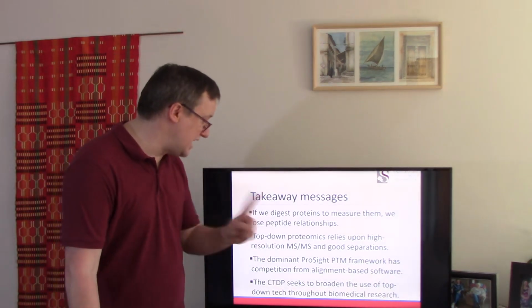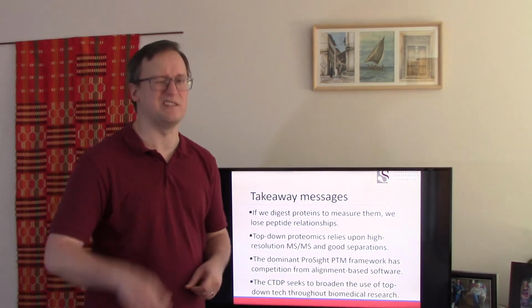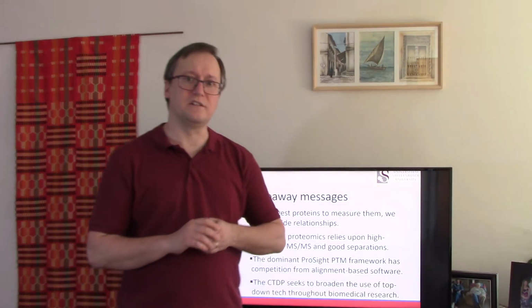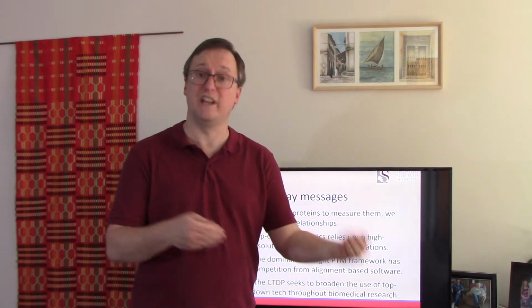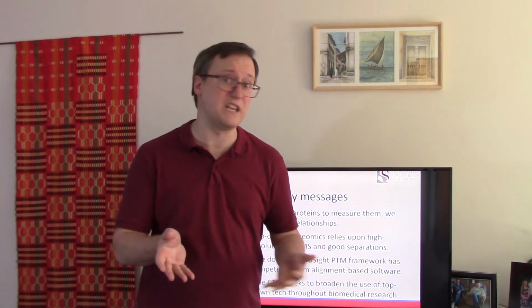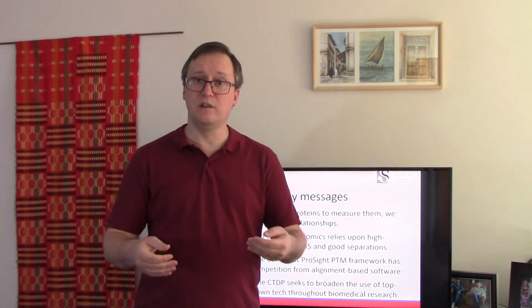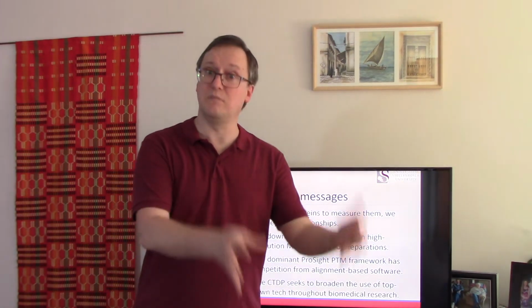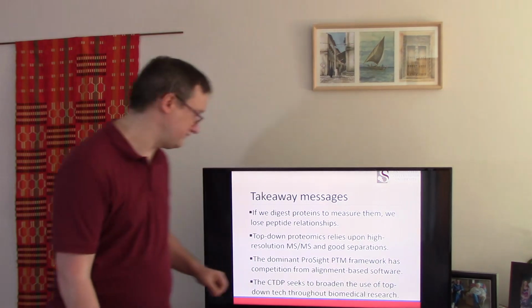Top-down proteomics relies upon high-resolution MS-MS, and it relies upon good separations and fragmentation technologies. This has been slow in some places, that we don't see, for example, a lot of electron transfer dissociation capable instruments in laboratories here in South Africa, for example. So my hope is that over time, the availability of the separation technologies and improved fragmentation technologies will go hand in hand with high-resolution mass spectrometry, even here in South Africa.